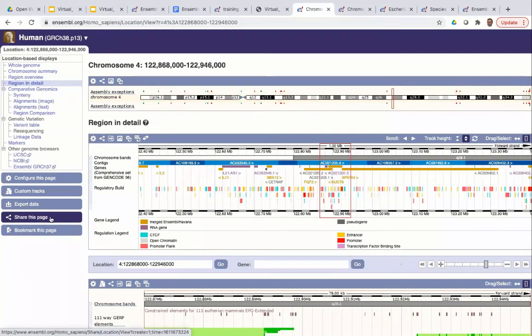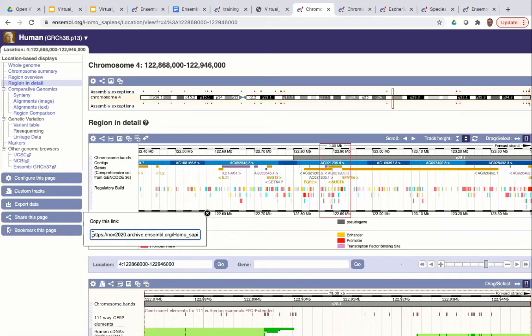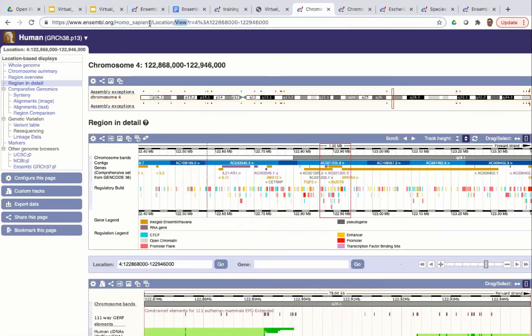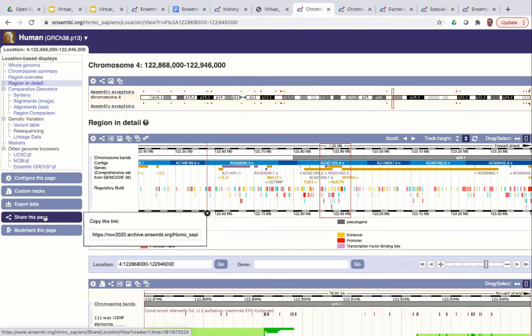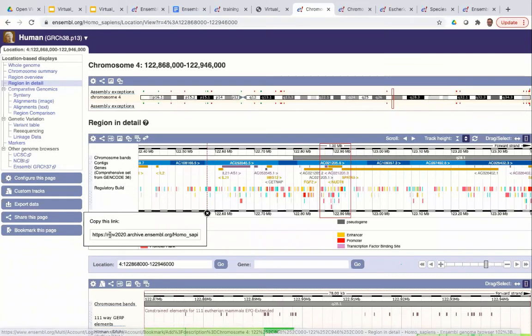The final blue button on the left is 'Share this page', which creates a unique URL you can share with colleagues and collaborators. Importantly, if you sent your collaborator the main URL from the address bar, they'd only see the default page. But using 'Share this page' means the person viewing the link can see all the data you've added — the tracks you've turned on, the formatting changes you've made, the zoomed-in view — making it a good way to share and collaborate on Ensembl views.